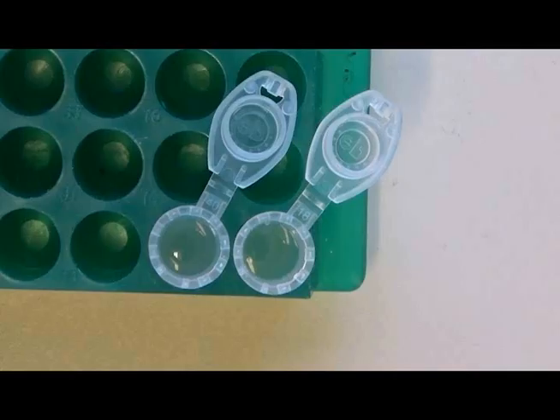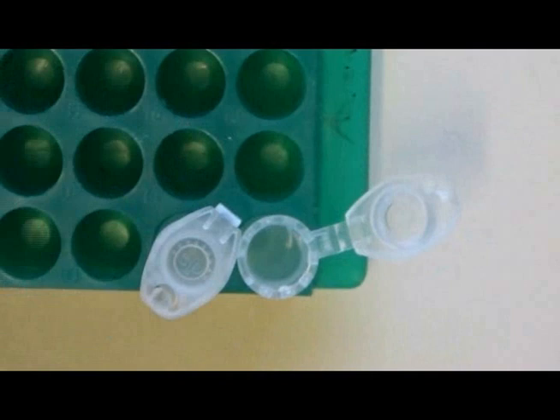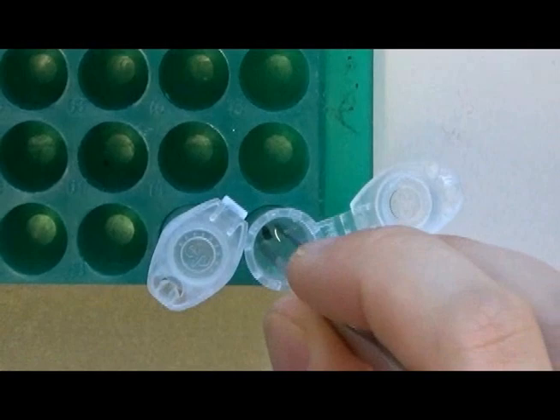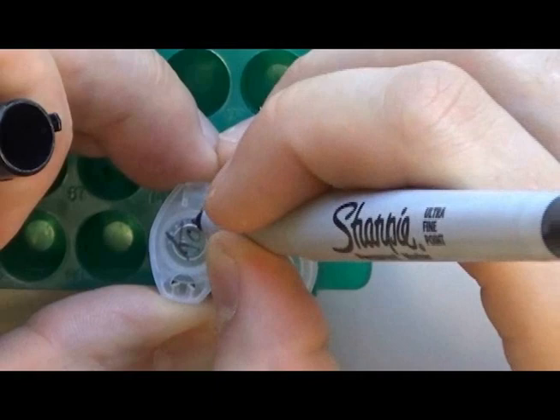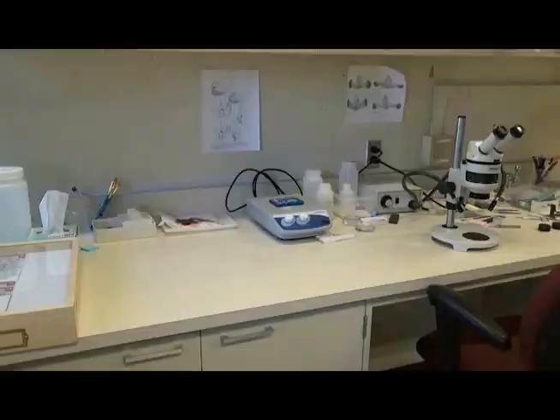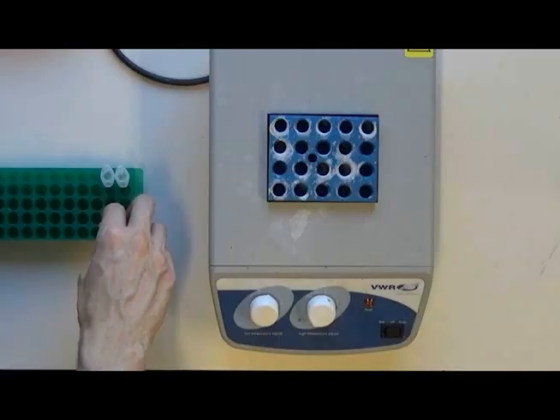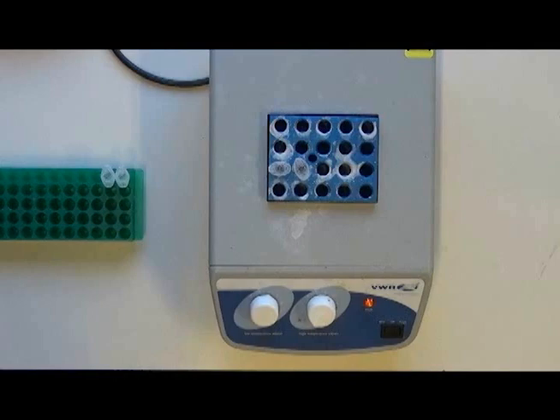I transfer the abdomens to my Eppendorf tubes, which are already filled with a 20% solution of KOH. An important detail to remember is to also label the tube with the name of the chemical inside — this is done for safety reasons. I then give the tubes a quick shake to ensure that the abdomen is fully immersed in the KOH. The chemical digestion process can take up to 24 hours at room temperature, or even longer for larger moths, so I like to speed it up using a heating block. This usually takes about 10 or 15 minutes, but I will check periodically to ensure that nothing is over-digested.